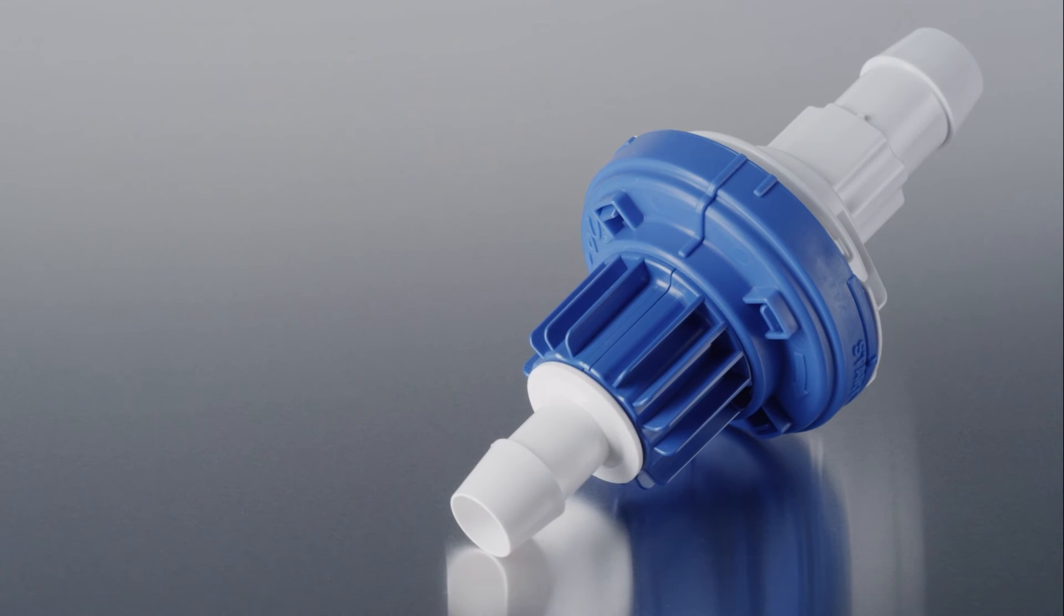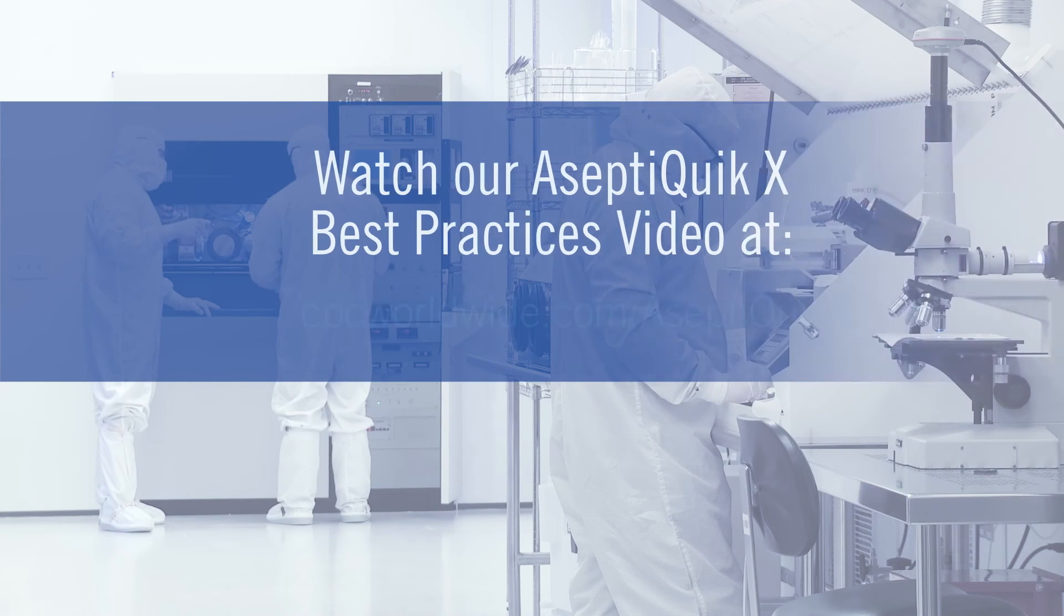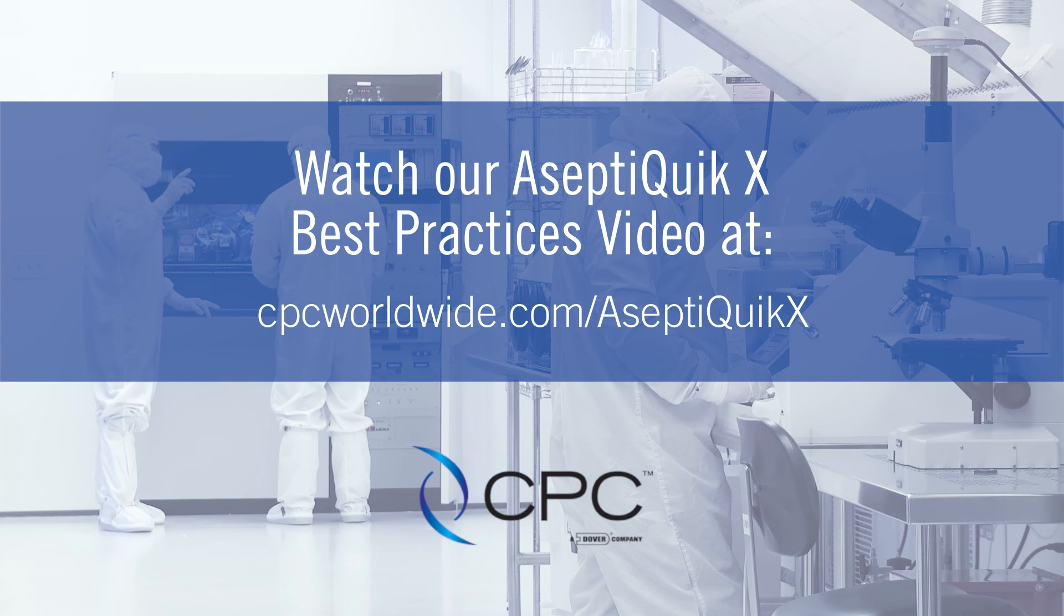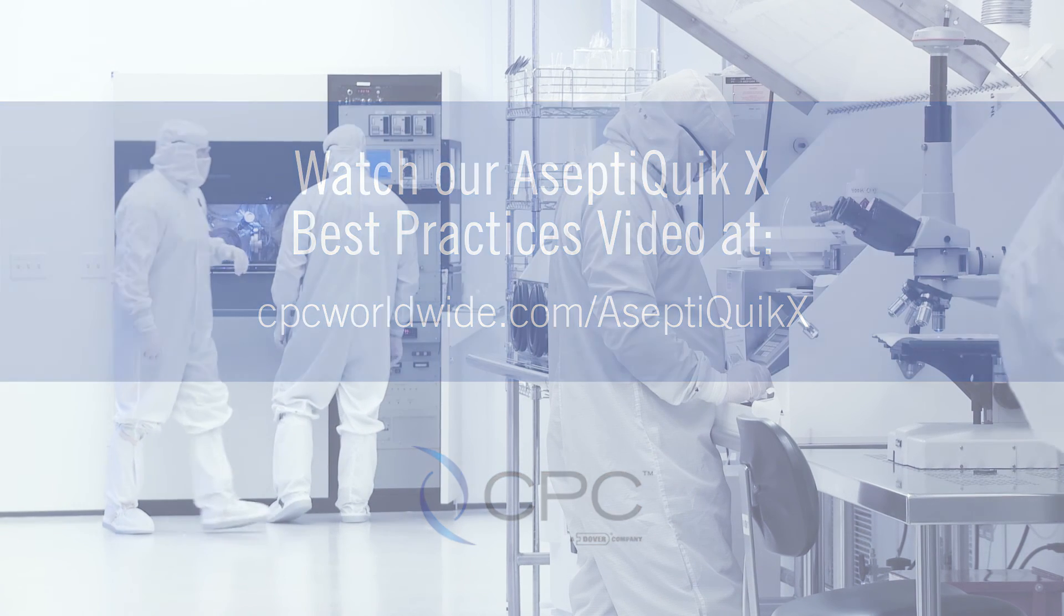Congratulations! You are now ready for sterile fluid transfer. For further details on the assembly process, please review our AseptiQuik X best practices video. Thank you for choosing CPC.